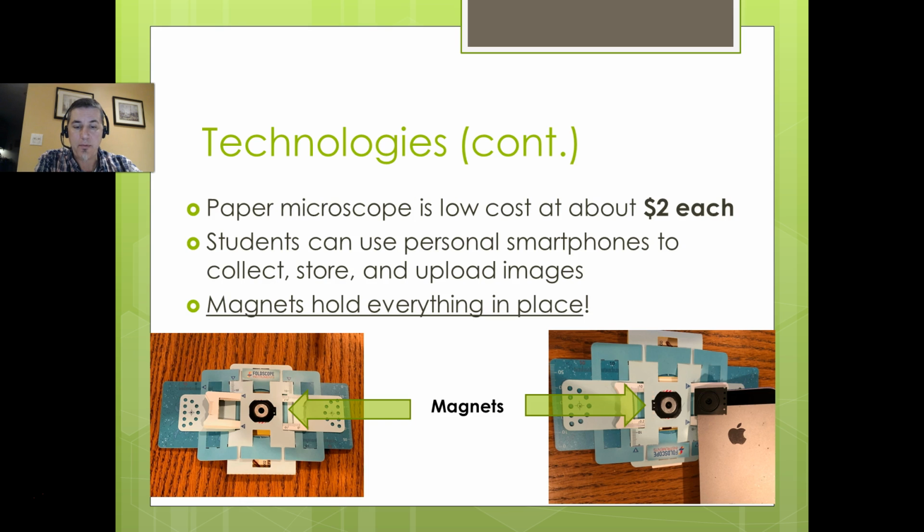So like I said, the paper microscopes were great. They were very simple to use. The devices were individually wrapped, and it was an origami kit to build a microscope and to hold samples with magnets that you would make on little pieces of paper, snap them in place, and the magnets held everything, and a magnet stuck on a cell phone would be able to view everything through the one piece of equipment. So really ingenious tool, inexpensive and effective.